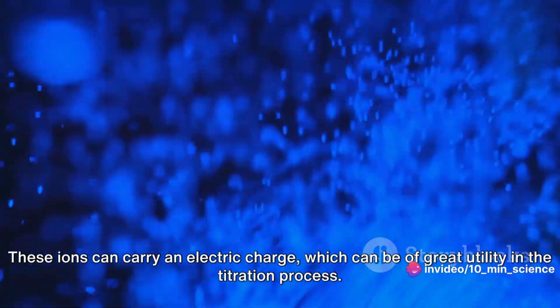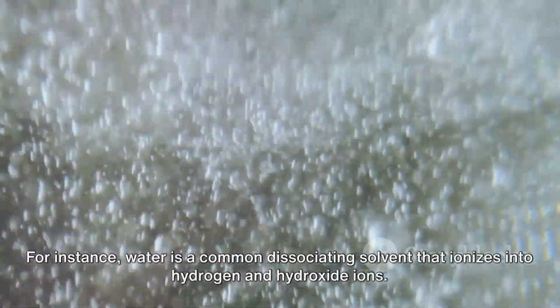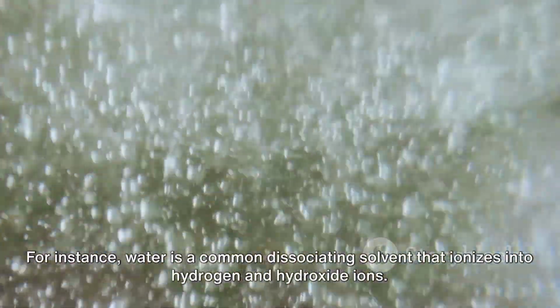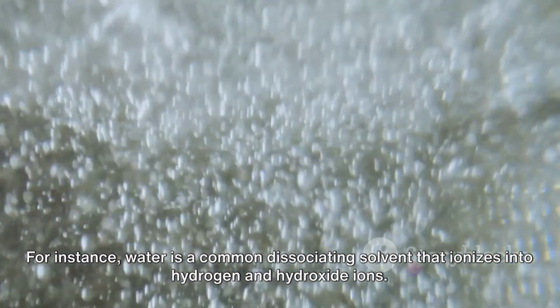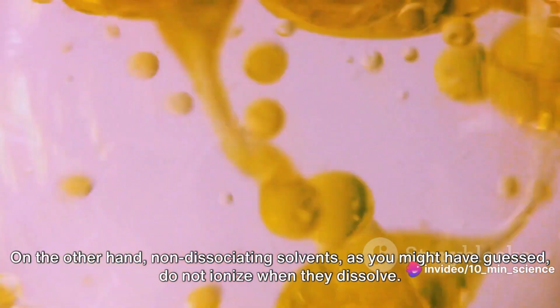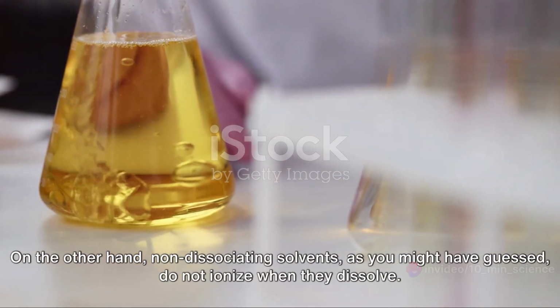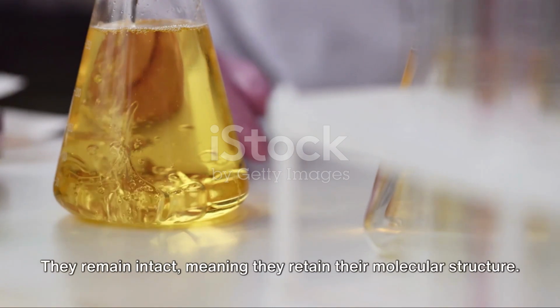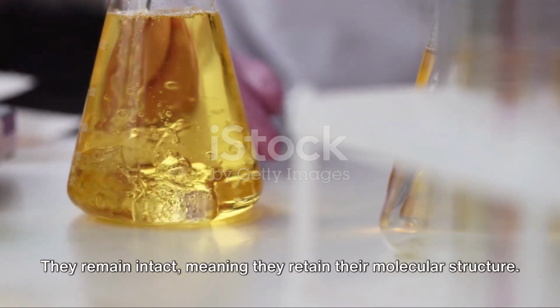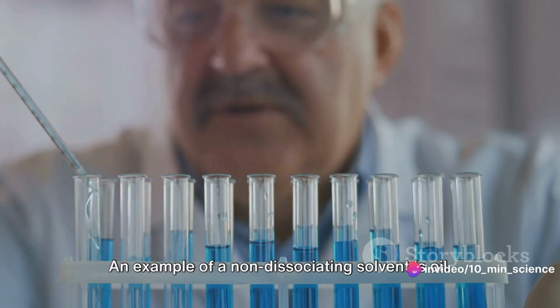These ions can carry an electric charge, which can be of great utility in the titration process. For instance, water is a common dissociating solvent that ionizes into hydrogen and hydroxide ions. On the other hand, non-dissociating solvents, as you might have guessed, do not ionize when they dissolve. They remain intact, meaning they retain their molecular structure. An example of a non-dissociating solvent is oil.